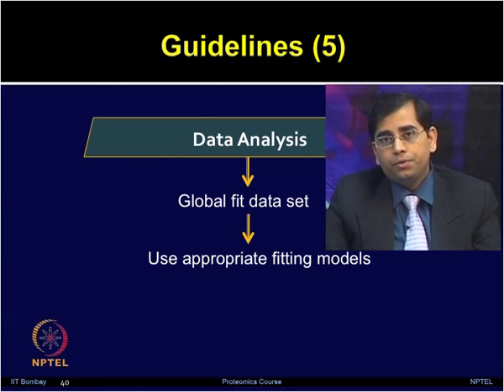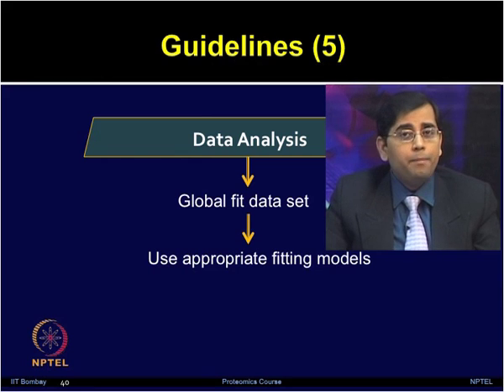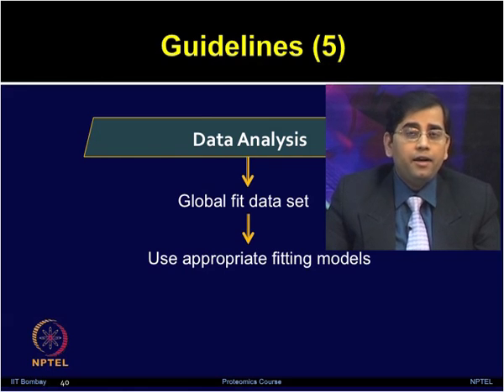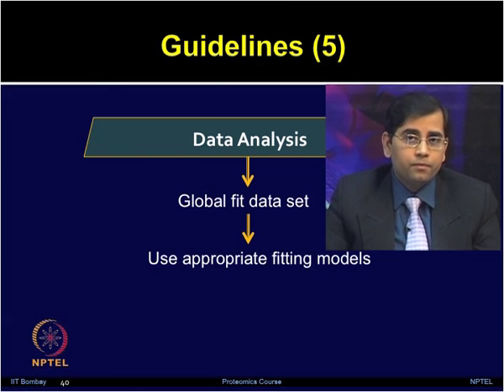So, what is the avidity issue? For a study, if you are talking about antigen antibody interaction, if the antibody is, for example, used as a query in solution, it can bind with 2 antigens and it will result in high apparent affinity, which is not going to give you a one-to-one model. Therefore, for such studies such as antigen antibody interactions, the antibody should be printed on the chip surface and the antigen should be floated to study the biomolecular interaction.